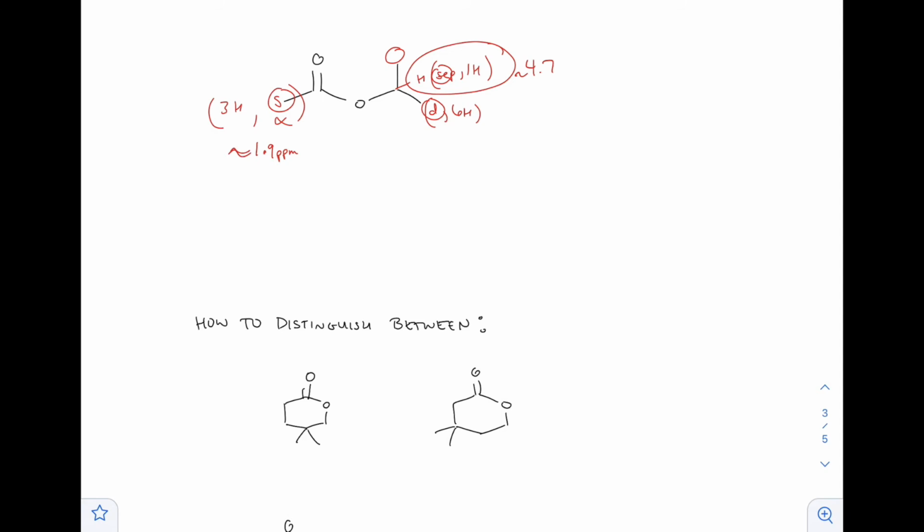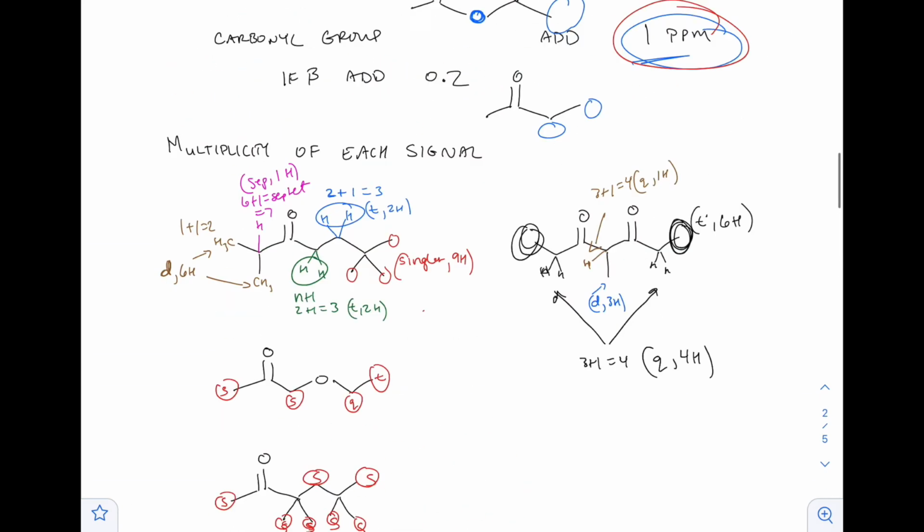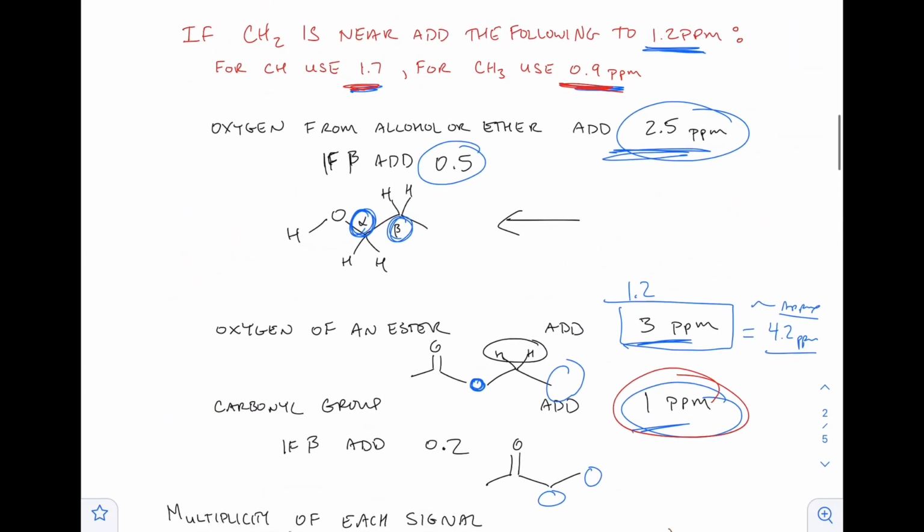Gets weird. So the CH3s, those, again, I didn't have them. Let's say they're, where's my 3? Did I mess up already? Did I use the wrong one? Oh no, 0.9.